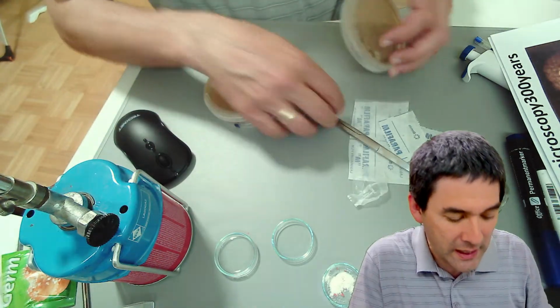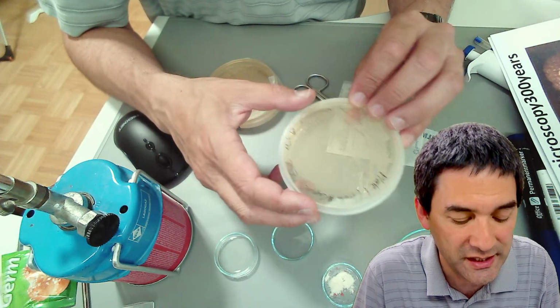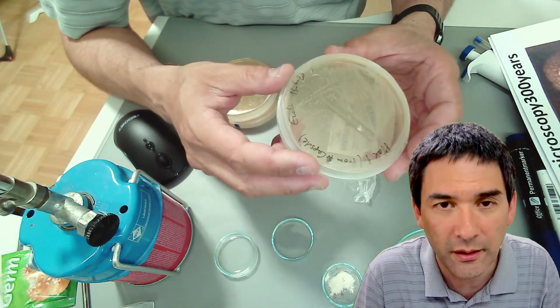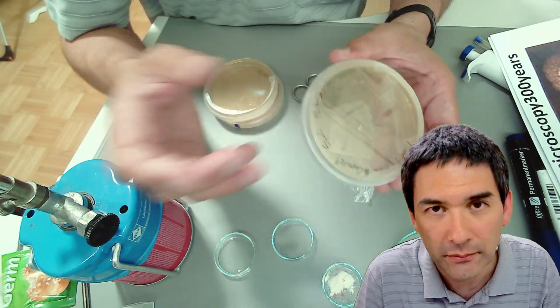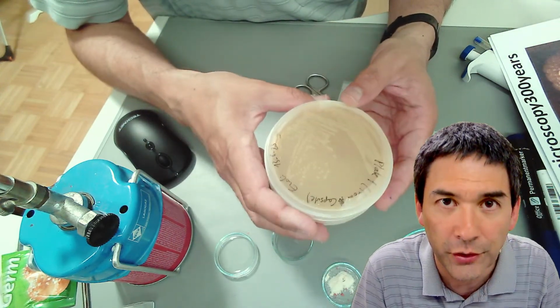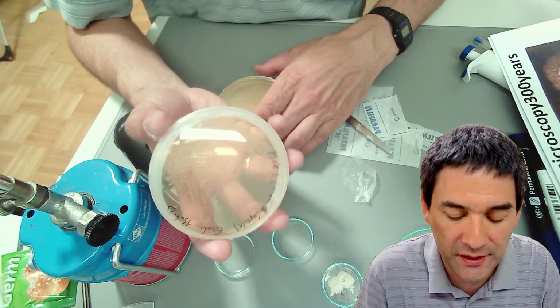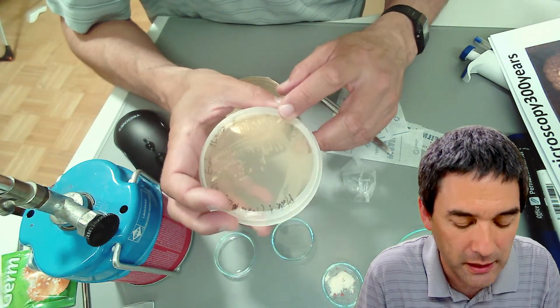The reason why I use the parafilm on the Petri dish is because, especially if you want to store them longer, it prevents evaporation of the liquid. Or what you can do is you simply stack them together and you put them into a plastic bag and then you put it into the refrigerator. That's also possible. But also for transporting the Petri dishes, it might be useful.